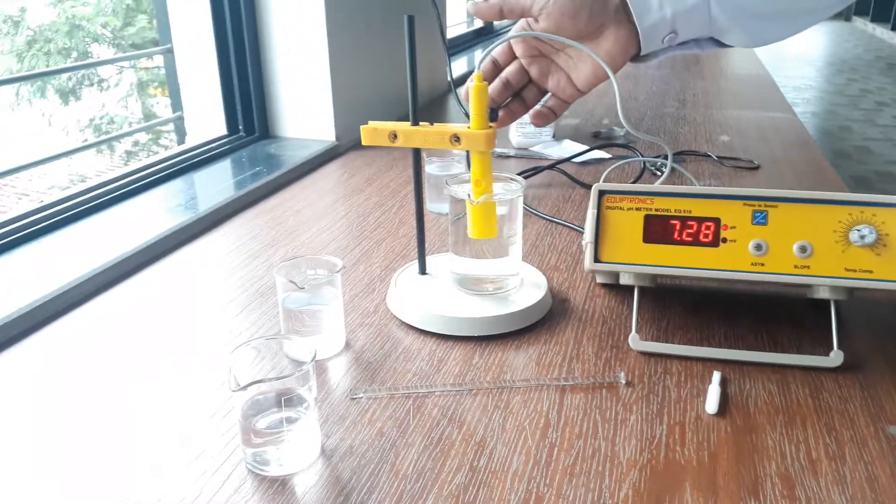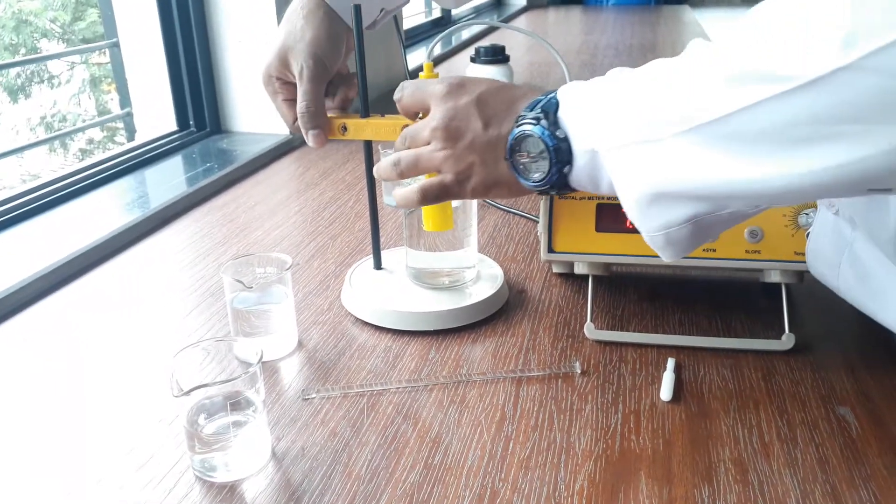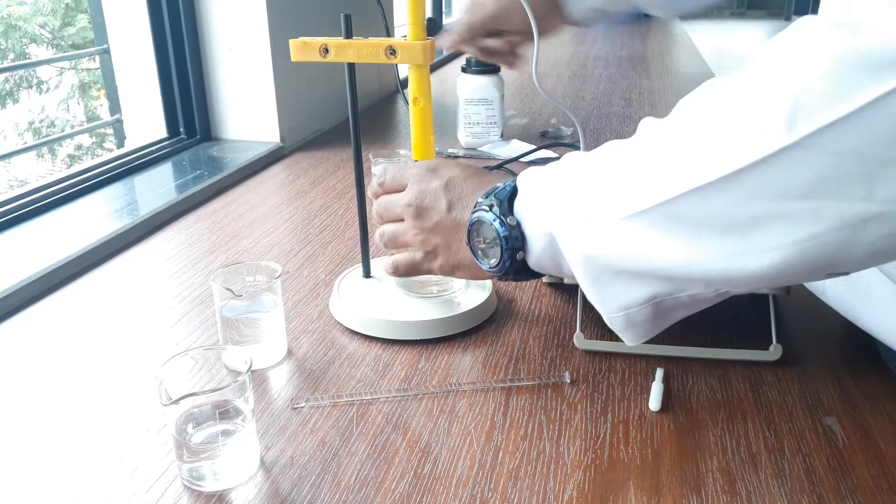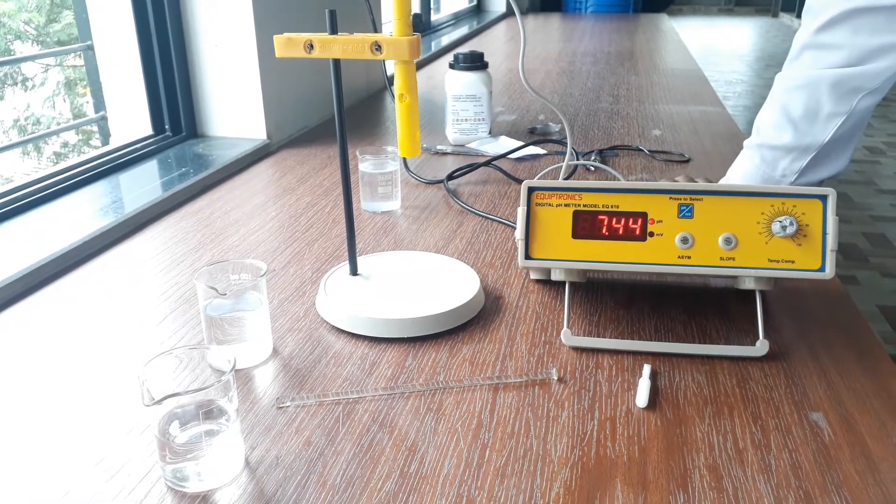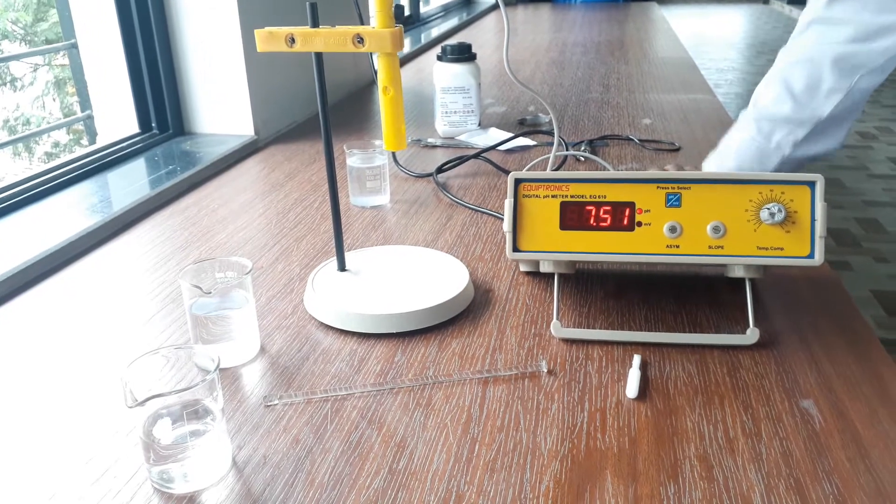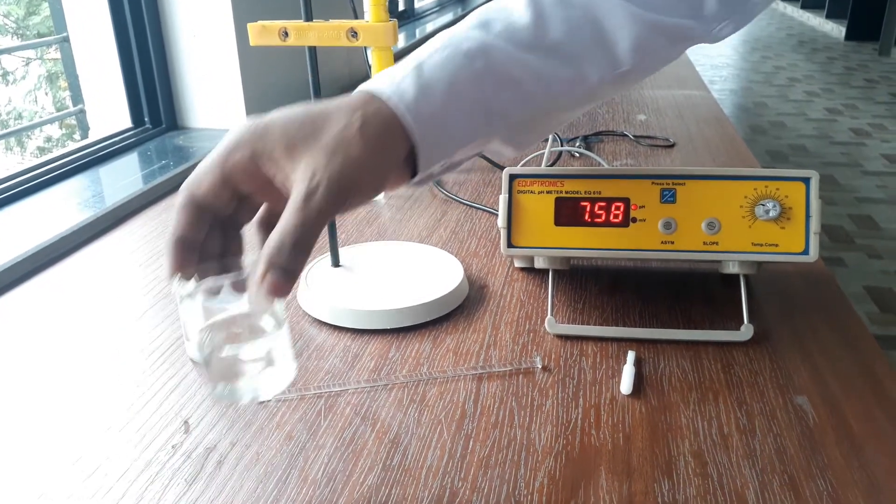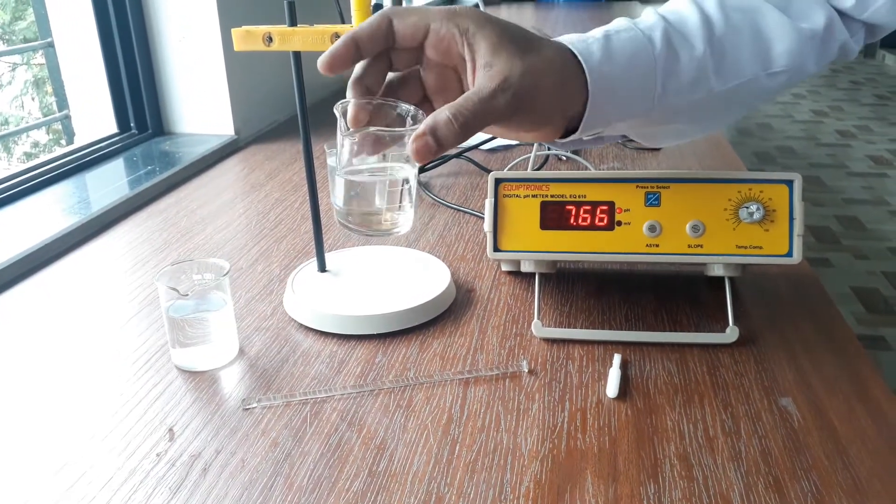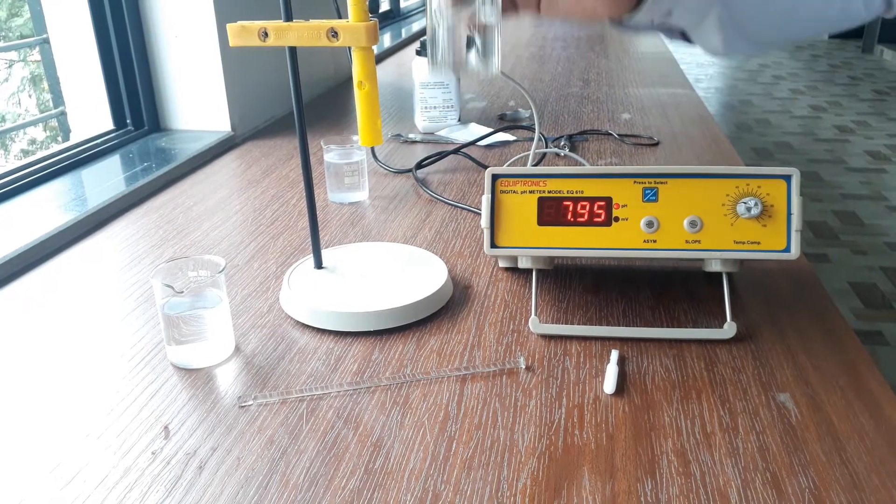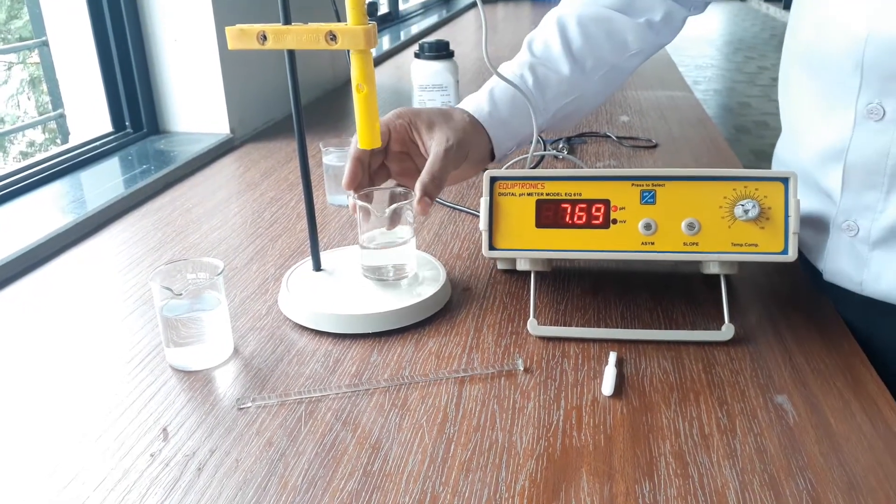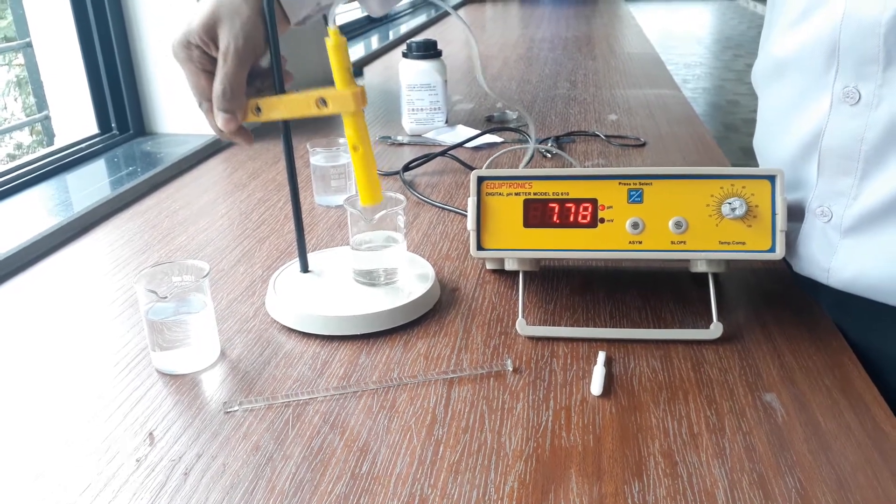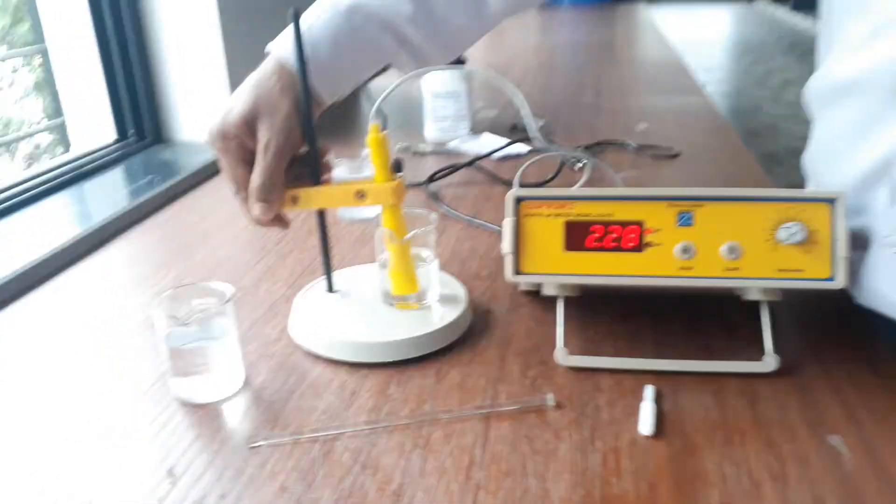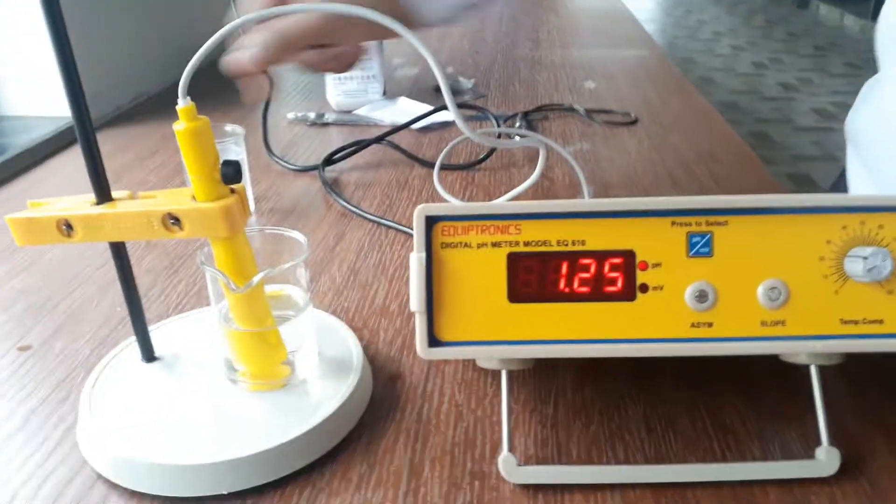After washing, then we will take another solution. In the first case we have taken water so there is no need to wash, but still for showing you how to wash we are doing that. Now this is our HCl, hydrogen chloride. So we will dip this pH meter in this solution.